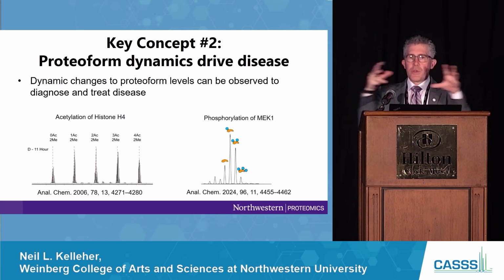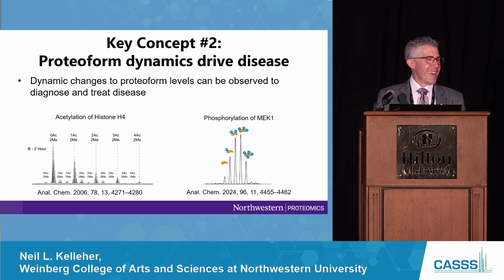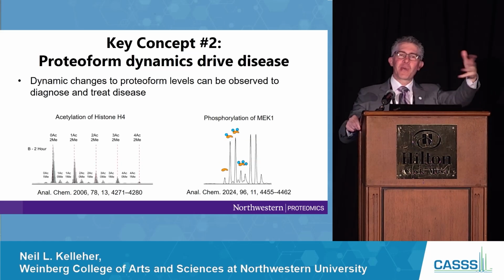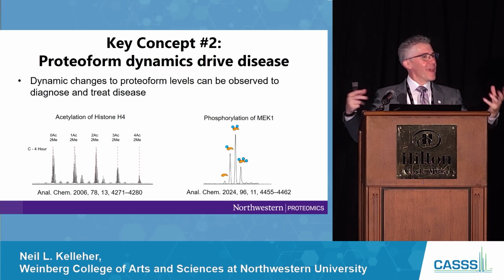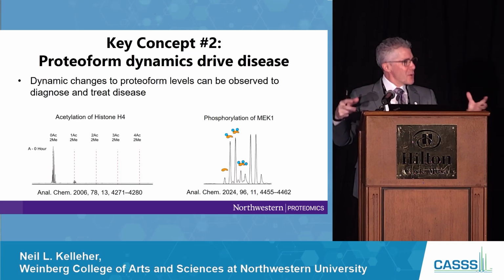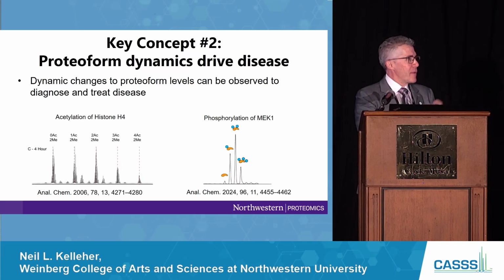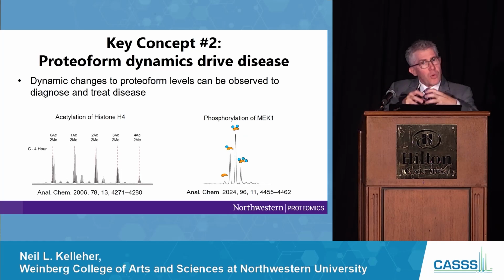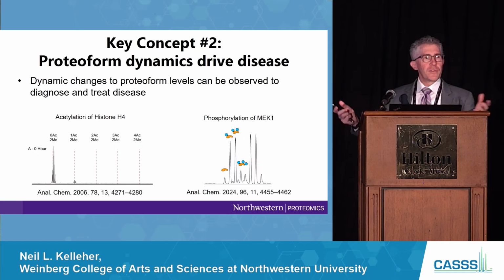And these things, when you digest it, there's an English nursery rhyme. Humpty Dumpty sat on a wall and had a great fall, and all the king's horses couldn't put Humpty Dumpty back together again. That is bottom up. Even if you have 100% sequence coverage, you don't get to the same perspective as this gives you in a single spectrum.